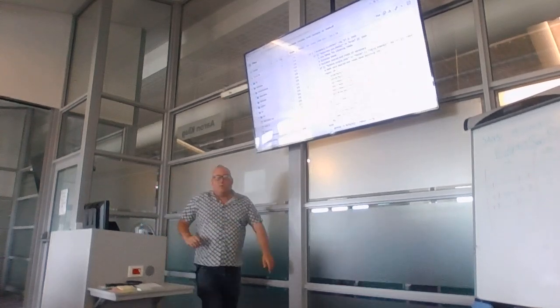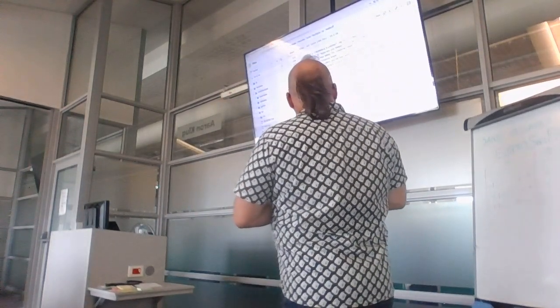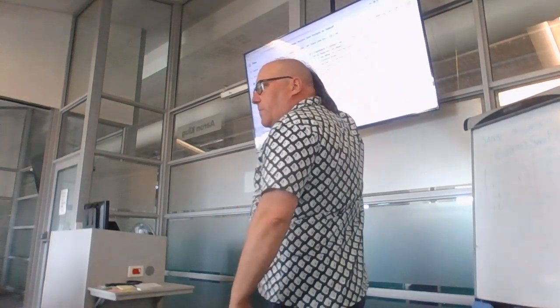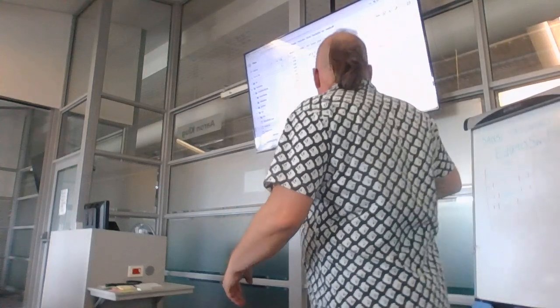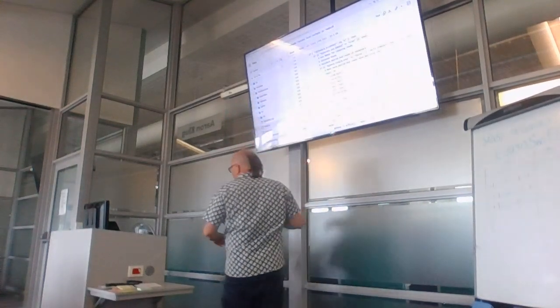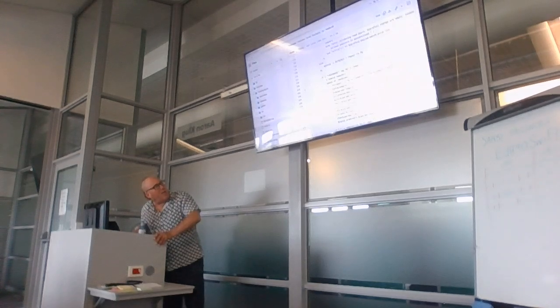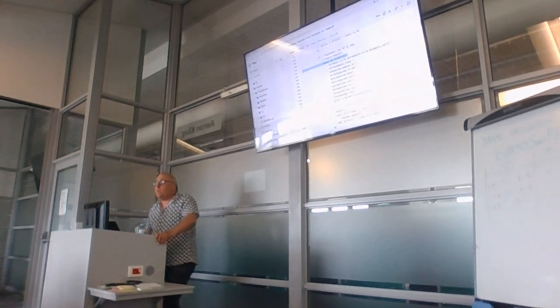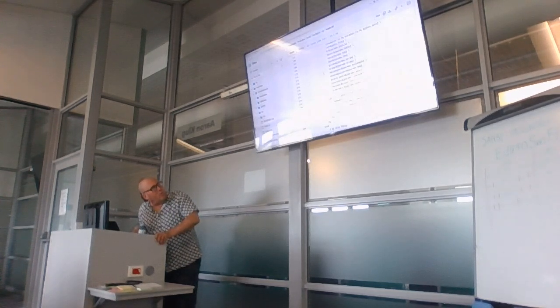Else, if we're doing Illumina, what is it doing? First, line 105, if we're using BBDuk, then it uses a thing called BBMap to clean the reads, okay? And it's doing some stuff to make sure that paired end reads have matching IDs, and then repair more stuff. It's unzipping some stuff over here. It's converting compressed to uncompressed, and then finally it's running BBDuk to do the cleaning. Okay, so this is all if we've enabled BBDuk. That's not the default. Okay, and then doing more BBDuk to remove PhiX and all of those kind of things. Okay.